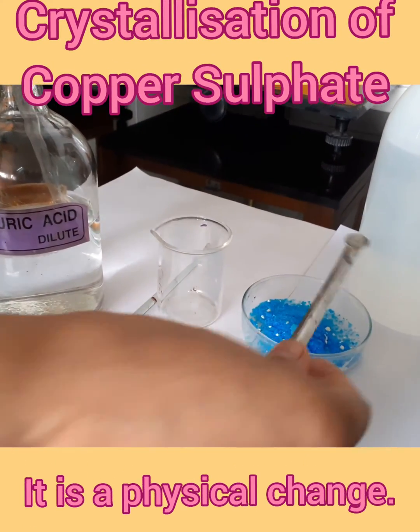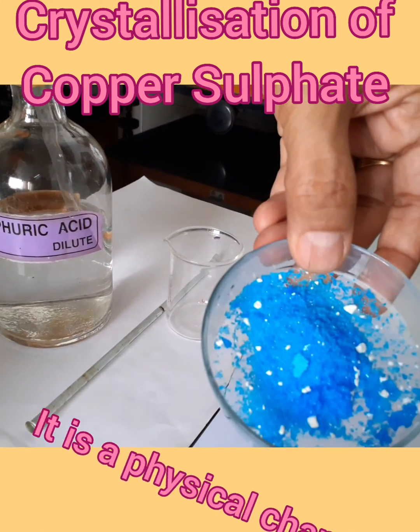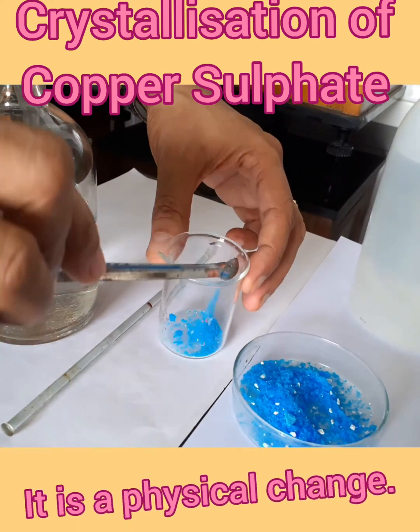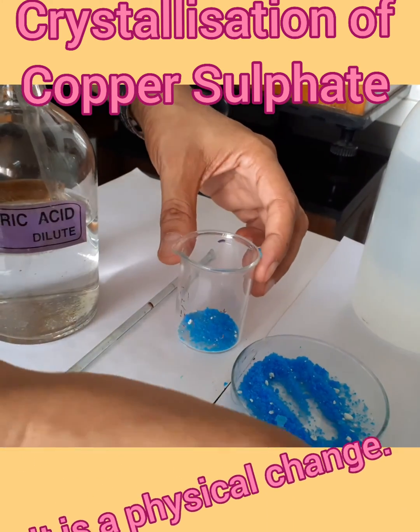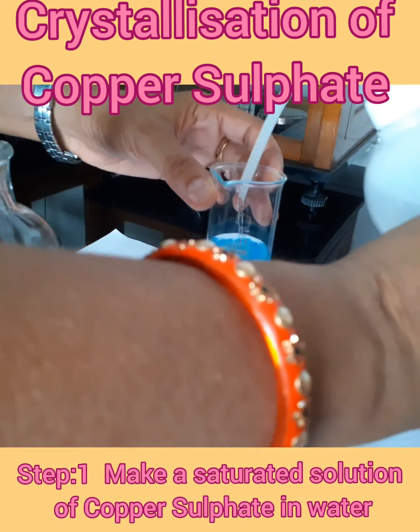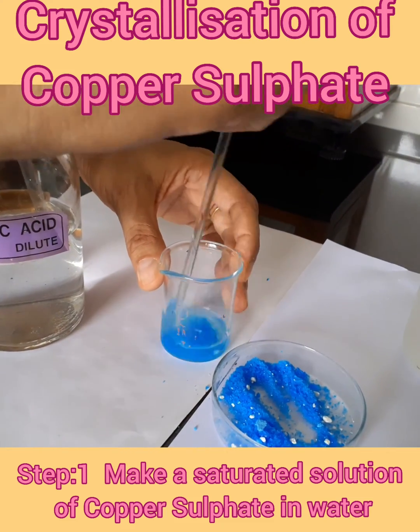For the crystallization of copper sulphate, these are the blue colored crystals of copper sulphate. We will take two spatulas of copper sulphate crystals and put them into a beaker. Then we will add some water into it and stir it to mix it.